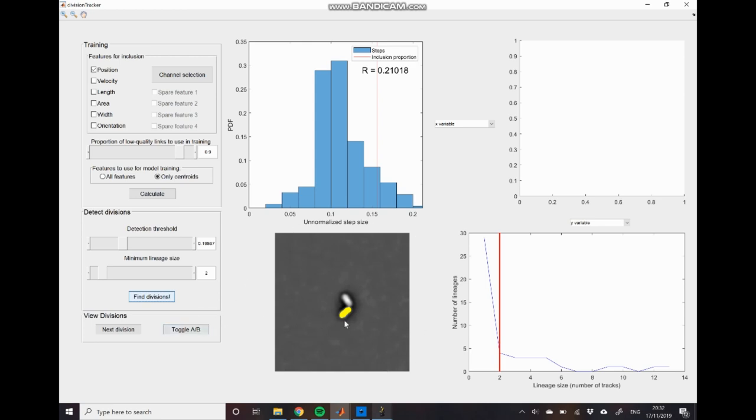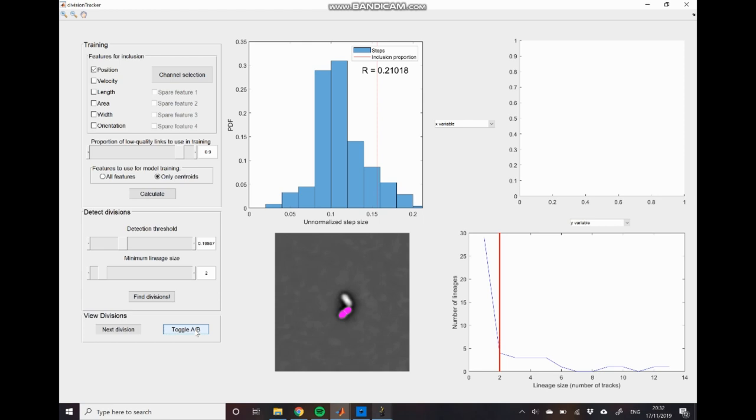To use this we start off with a kind of mother time point and here you can see that we have the mother cell marked in yellow and then we click toggle AB similar to in the tracking GUI and we can see that we have the two daughter cells which have been assigned to that mother marked out in purple. So you can see that this indicates that we have accurate assignment of this division event between this mother and the two different daughters.